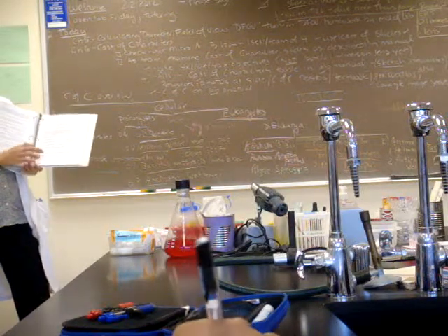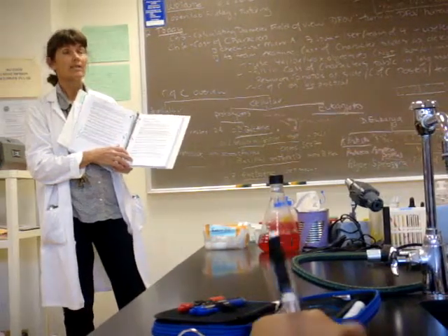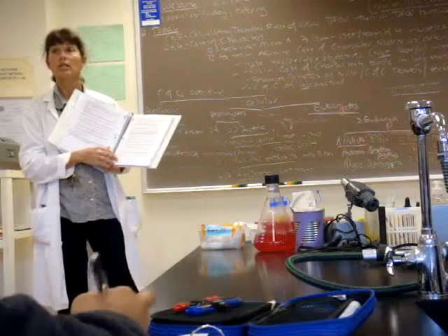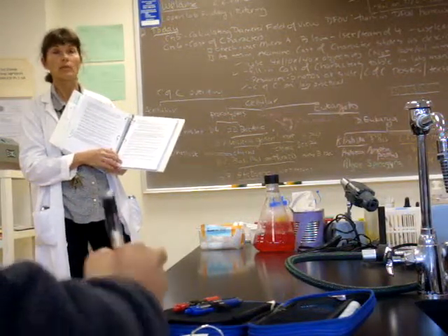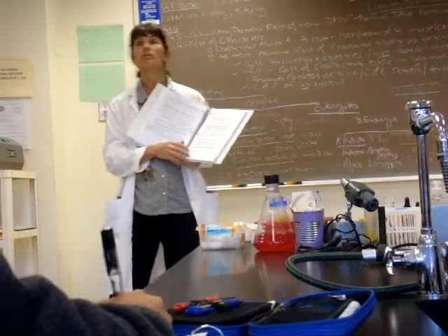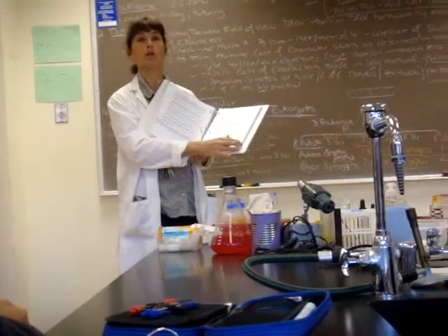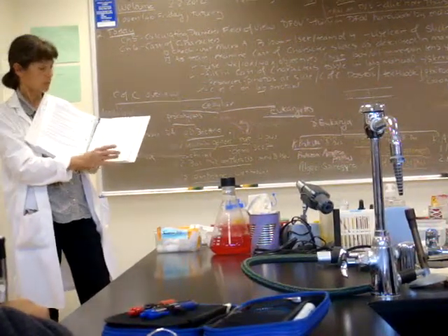Now, the heads up here, you guys, Rhizopus, like many fungi, can reproduce asexually or sexually. So the two slides you're looking at show you, one of the slides is showing asexual reproduction in Rhizopus. The second slide shows sexual reproduction, and they look very different. So just be aware you aren't going crazy. Okay, that's them carrying out two different types of reproduction.